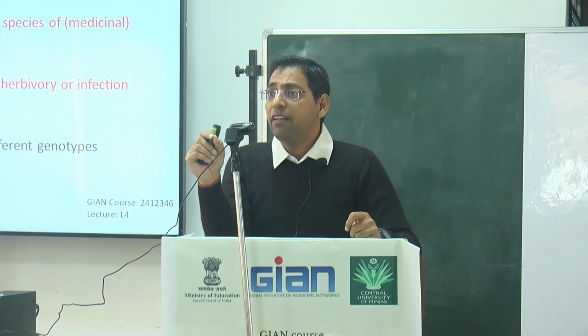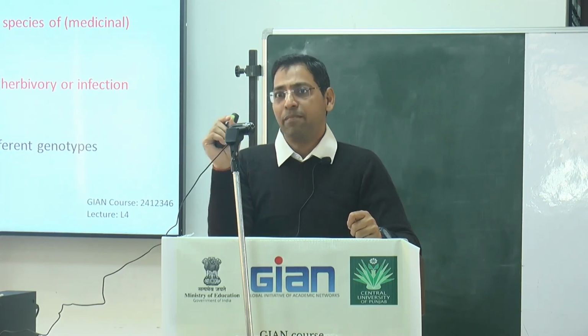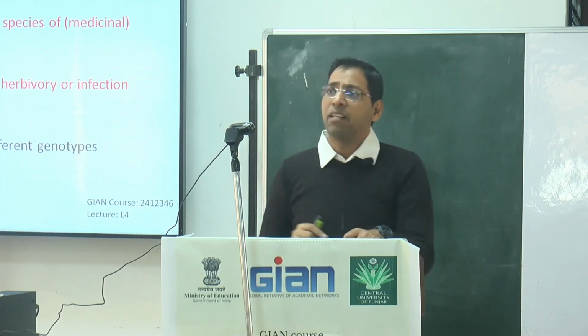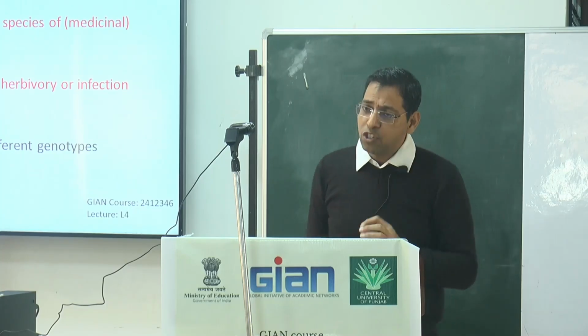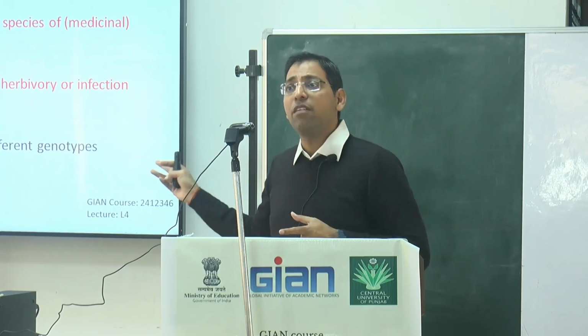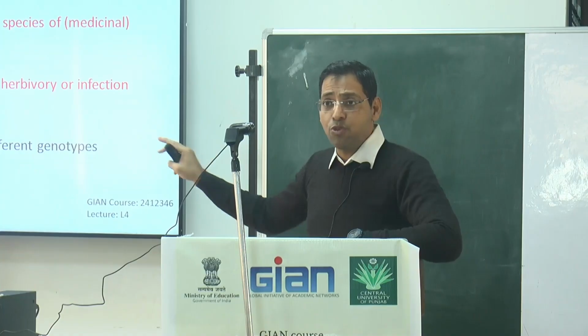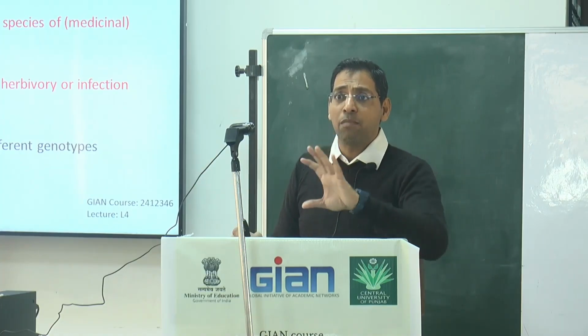And physiology means water potential, first thing, and second is the secondary metabolite. So those secondary metabolites, which are responsible to help cope with that particular situation, we can monitor those things also. If your experiment comes in this situation, you can use the NMR very well.